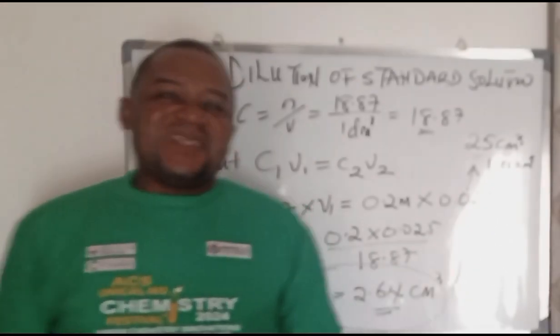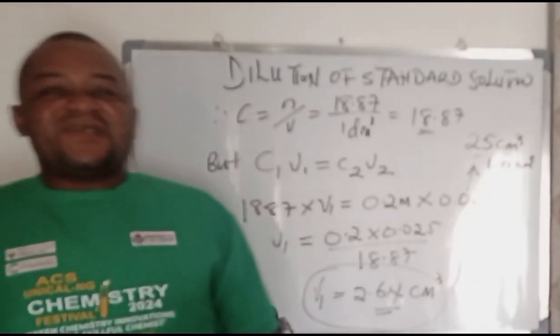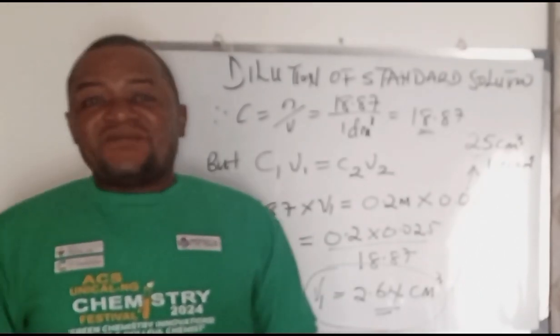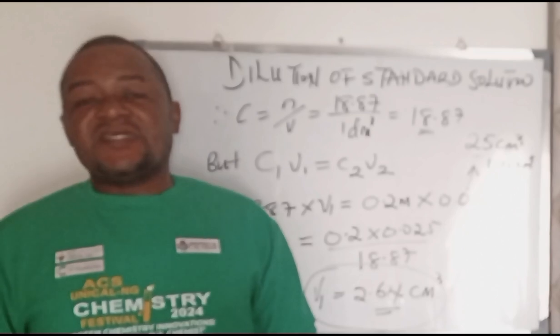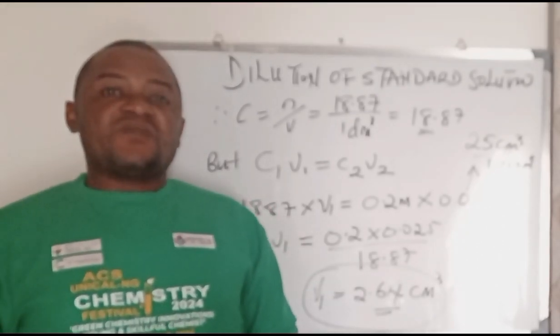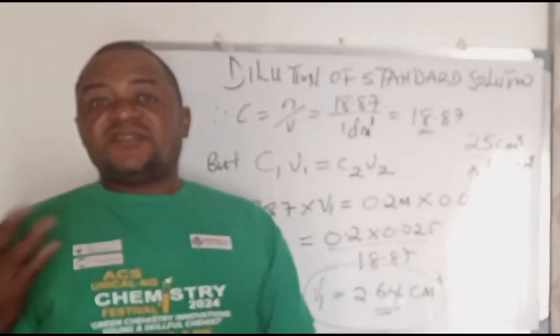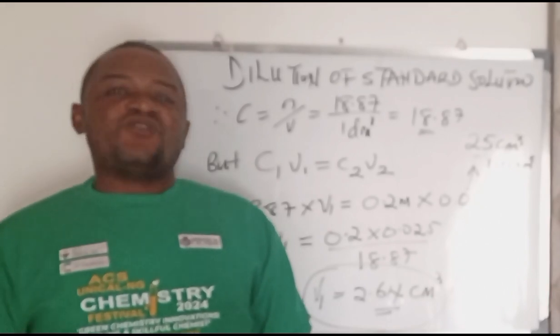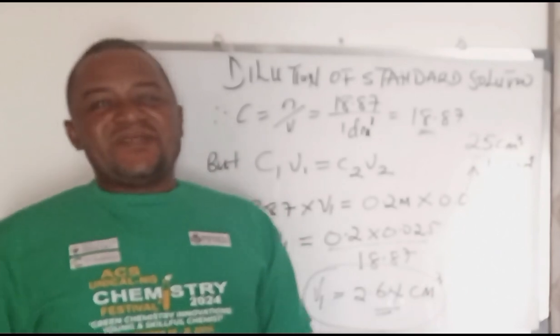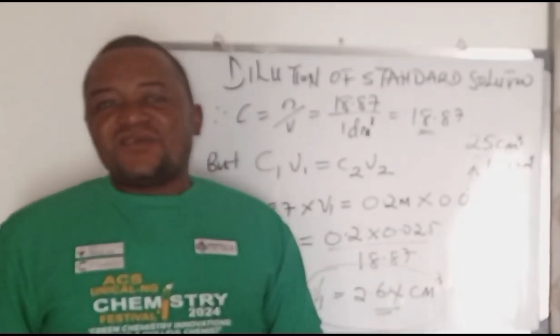I'm sure that you have been able to learn something again today, how to carry out dilution of standard solutions. You have to know these things because they are very important. You can be confronted with this even at secondary school laboratories, even in your university laboratories, even in your company laboratories, where you need to dilute certain solutions. We are going to look at how we can carry out serial dilution in our next classes, and then see how we can go about other laboratory techniques before we go again into the normal courses that we have in our various universities.